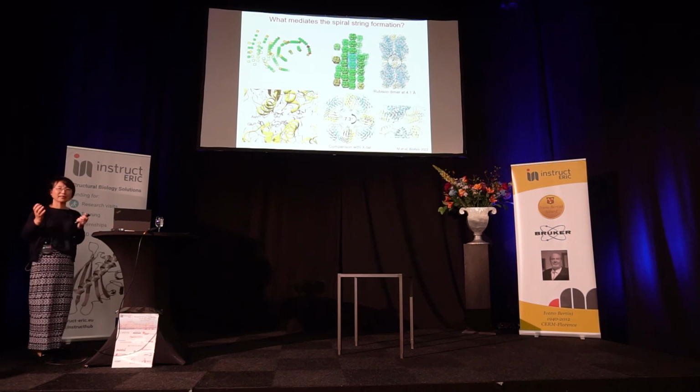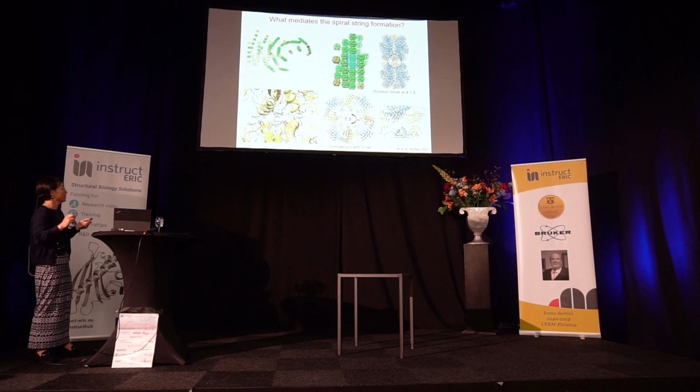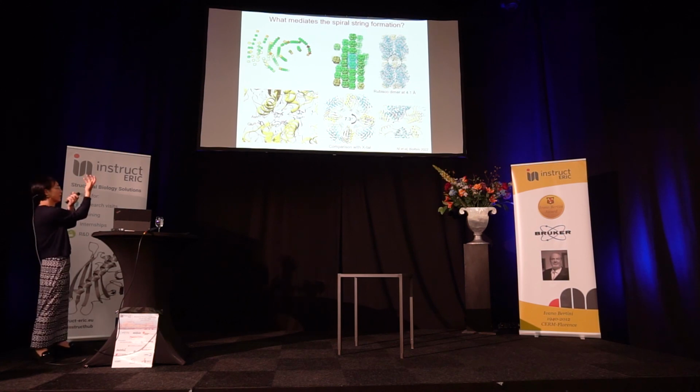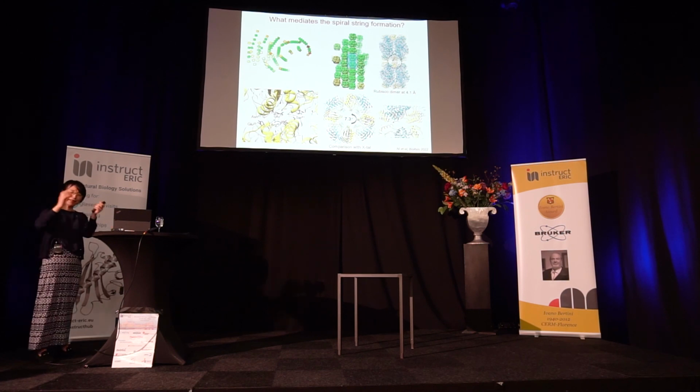Now there's a crystal structure I mentioned of Rubisco. There are crystal arrays, and then we can analyze the lattice contact or crystal contact. Compare this interface to the crystal contact, where the colored one is from cryoET and the gray one is from crystal. You can clearly see there's a twist between the two Rubisco molecules compared to crystal. Crystal is straight up, and this one has a twist, a seven degree twist. This twist allows the Rubisco to assemble this spiral array against each other, as you can see here. So we map all the Rubiscos back into the carboxysome.